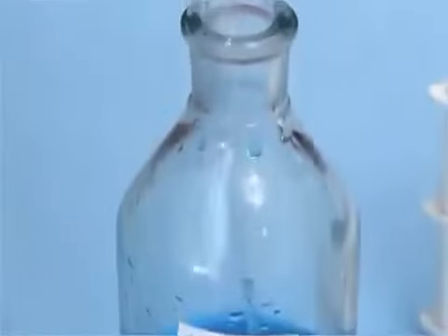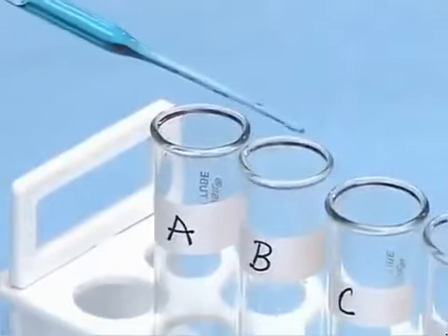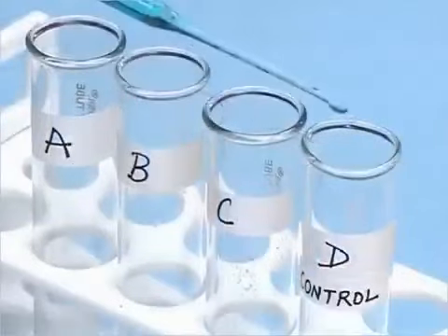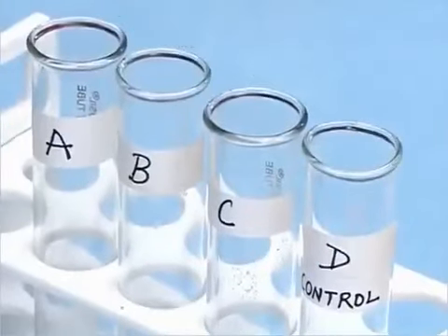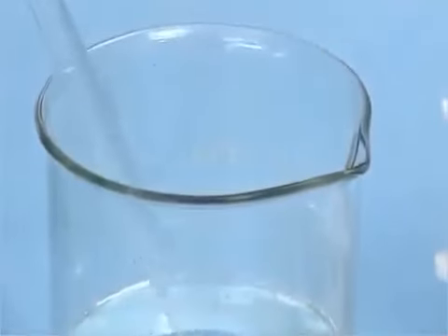Now with the help of a dropper, add 2 drops of copper sulfate solution and a few drops of caustic soda to each test tube.